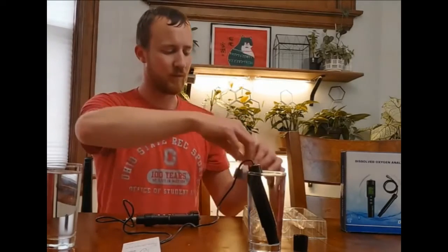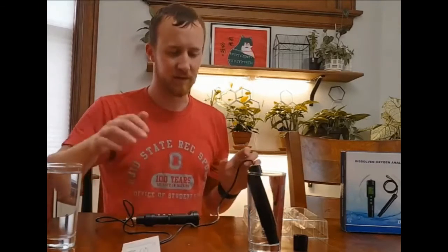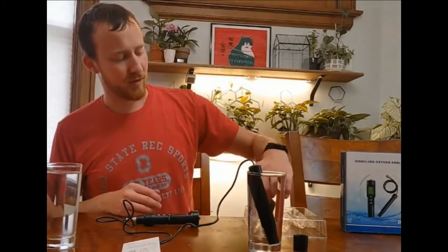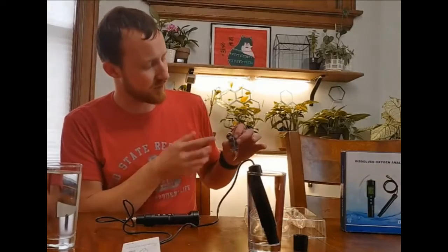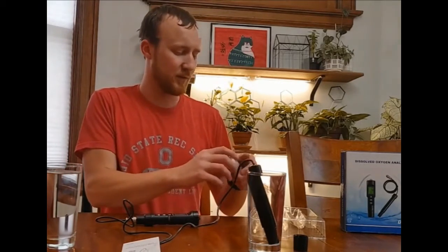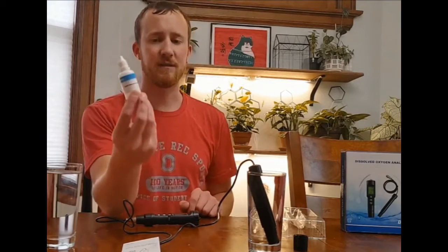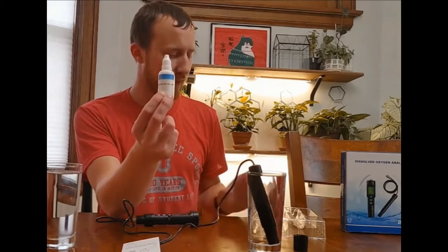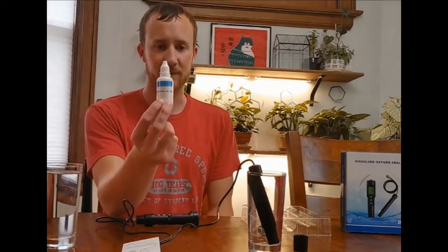There are six of them that come in this pack. These aren't single-use items according to the instructions. They are usable multiple times. The oxygen will go through the membrane into the solution, which it also includes. This is an electrolyte solution.